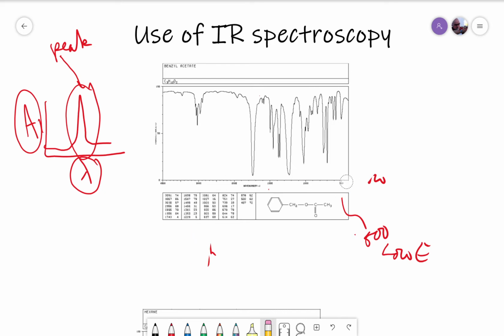Once you get used to the fact that peaks are hanging from the ceiling and the numbering system appears to be backwards, there is a lot of utility. Just like in UV-vis, you can use Beer's law, but the real power of IR spectroscopy comes out in the specificity at which the bond vibration occurs.